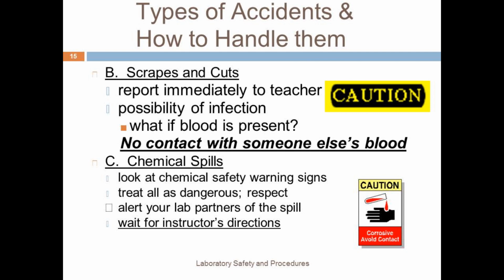If there is a chemical spill, make sure that you know how to dispose of that chemical spill correctly. Most times you will tell your instructor and they will explain the correct disposal. We do have a chemical spill kit in the back in the orange tub that's basically like kitty litter, which will absorb and neutralize the chemicals.